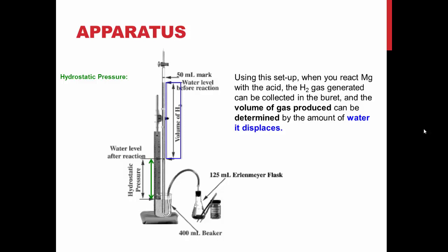Rinse the 125 milliliter Erlenmeyer flask with deionized water, making sure it is clean before use. Using a graduated cylinder, add 25 milliliters of 1 molar sulfuric acid to the flask. In a clean glass vial, accurately weigh out 0.025 to 0.035 grams of magnesium turnings. Record your mass. Carefully place the vial into the flask using tweezers, not allowing any sulfuric acid to come into contact with the metal. Seal the flask with the stopper as shown, and connect the rubber tube to the glass connector, which should also be connected to the bottom of your burette.